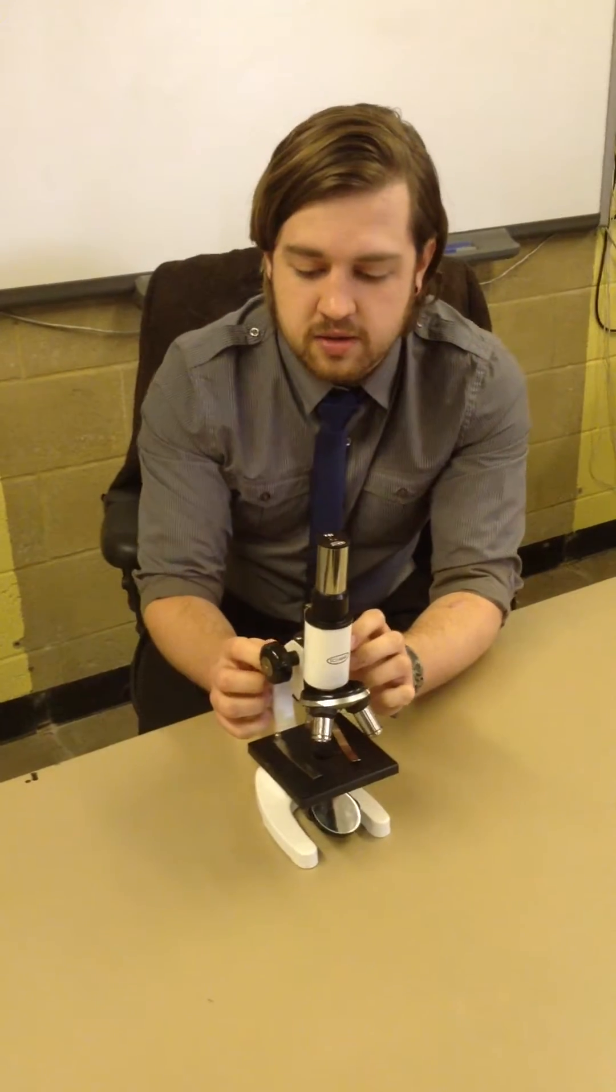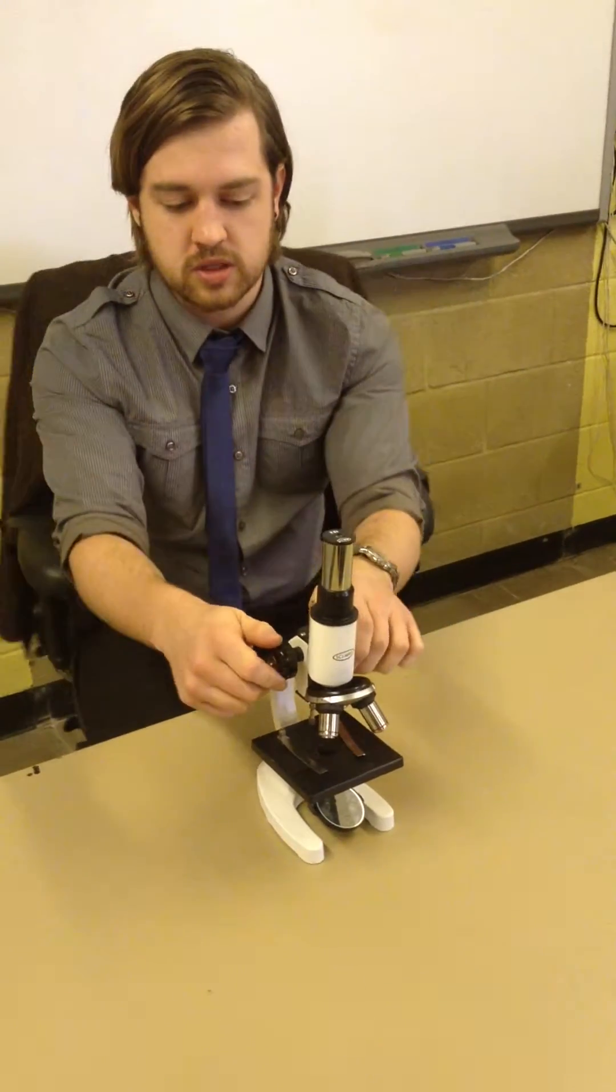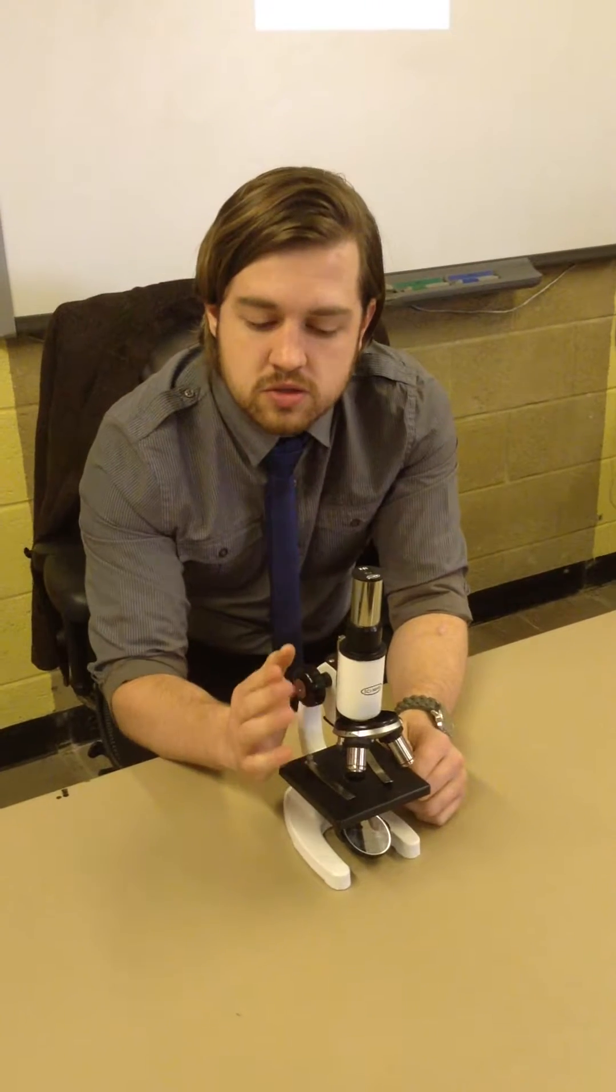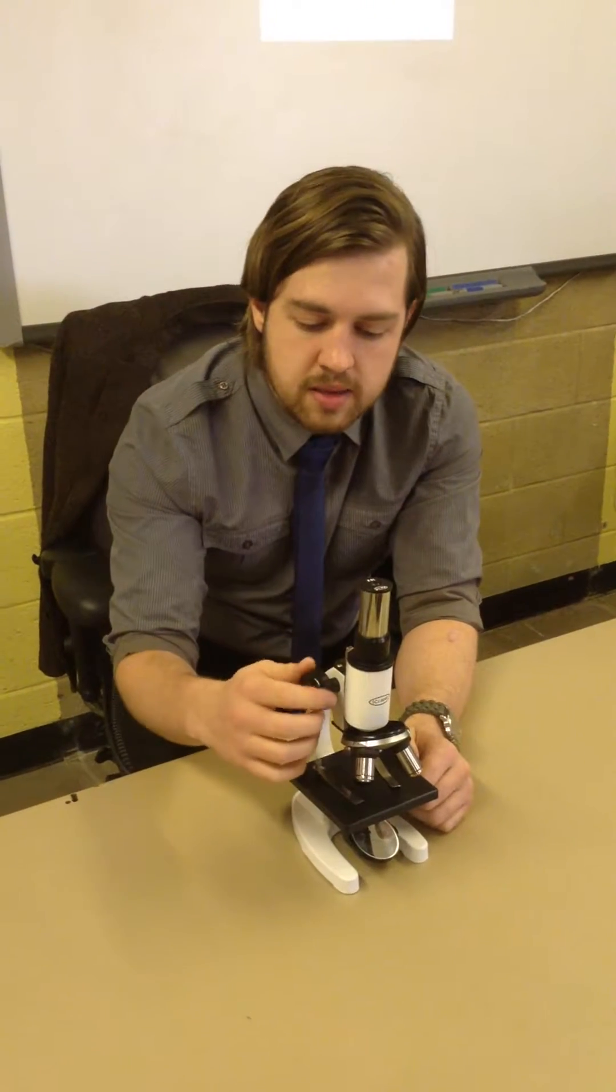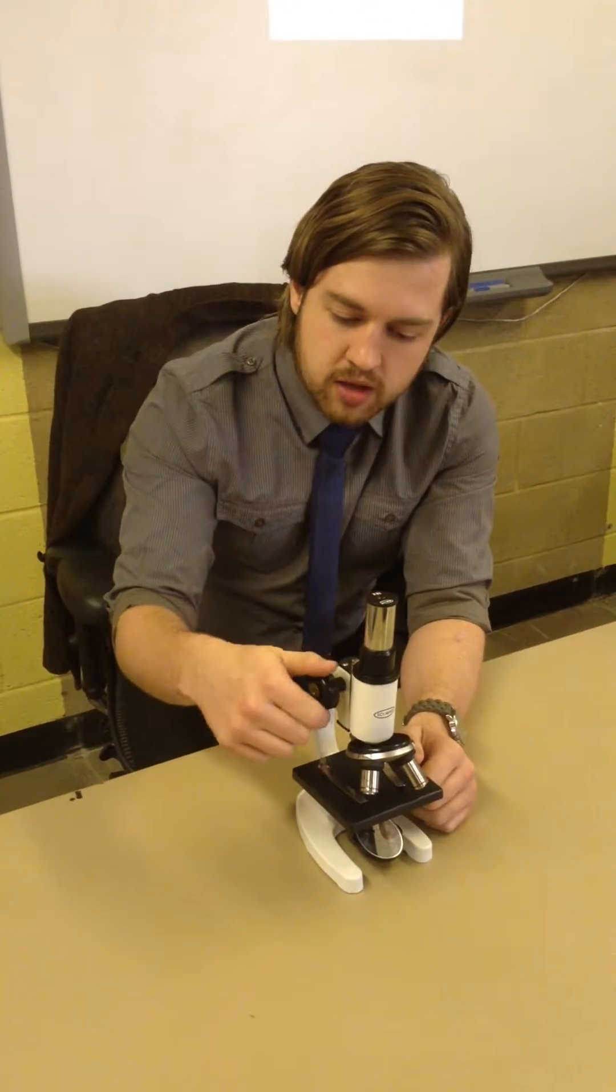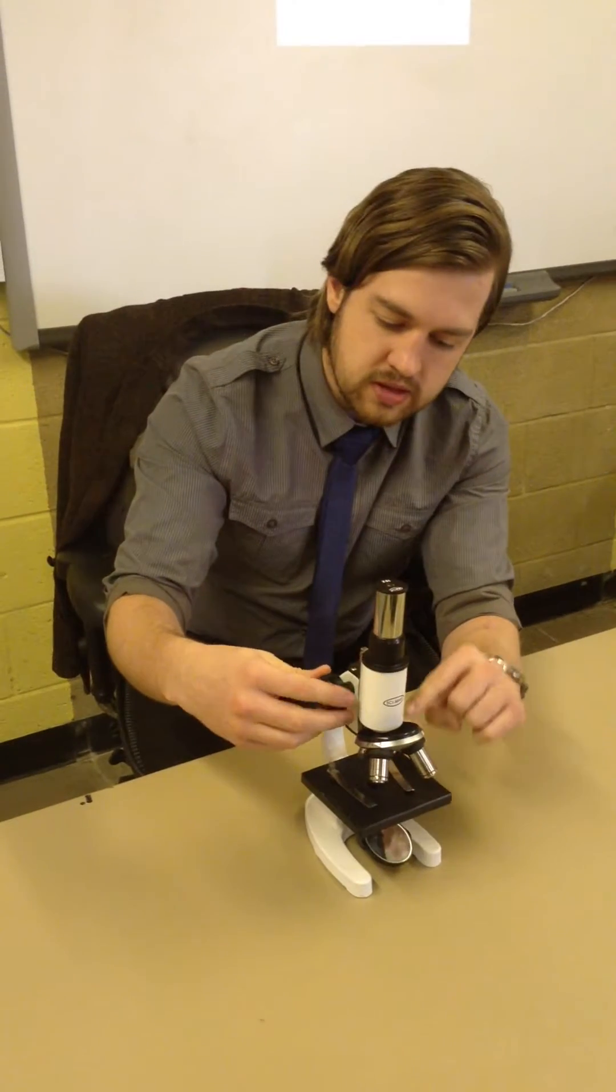The next thing I'm going to focus on is these. These are your focusing wheels. Now, some microscopes in the school have two focusing wheels, some only have one. You use the focusing wheel to move these lenses closer and further away from the slide in order to focus the image.